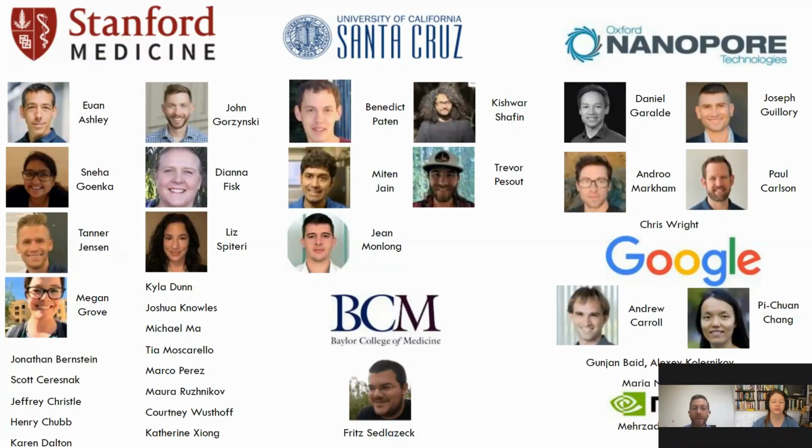Yeah, thanks. That's a great question. So the next steps in this project are really to scale it to a point where we can do many more patients. So this initial part of the project, we only sequenced 13 patients.